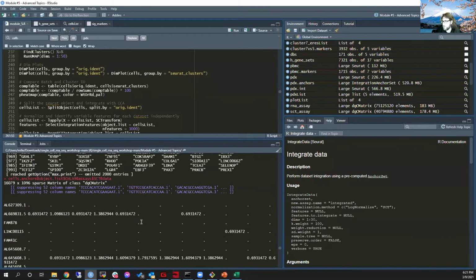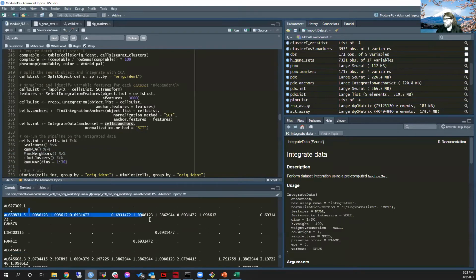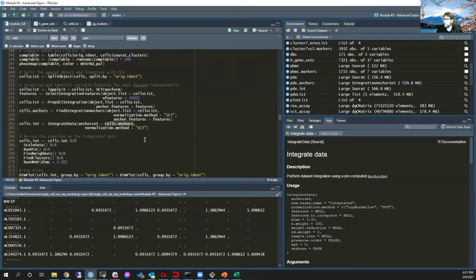Okay. All right. So at this point, by the time it gets here, it has already narrowed it down. Interesting. Very interesting. So something before this point is what does it. If this is not interesting to you, then do feel free to continue working on the actual assignment.